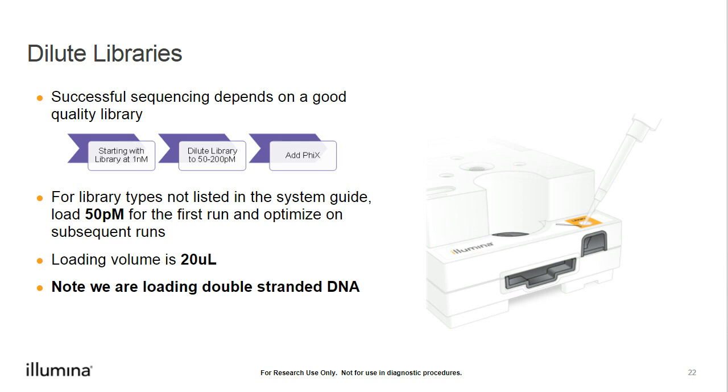If you have any questions about that, feel free to reach out to us in technical support. We're happy to go over your library composition and recommend certain PhiX concentrations, or PhiX spike-ins, that might help get us to a successful run.